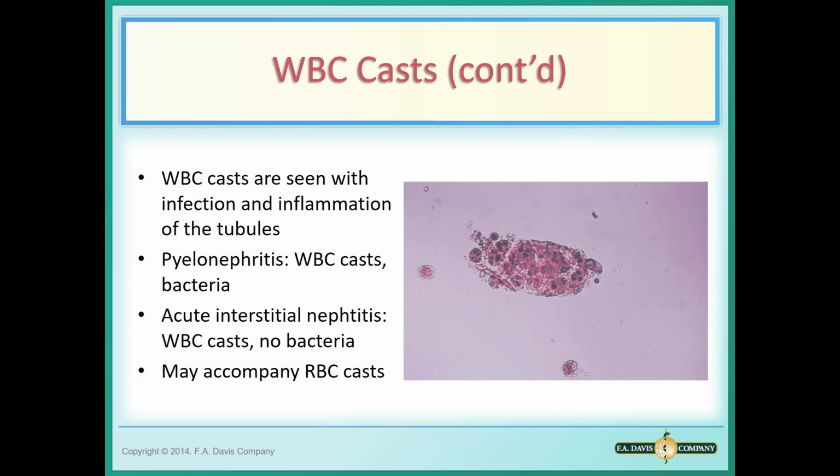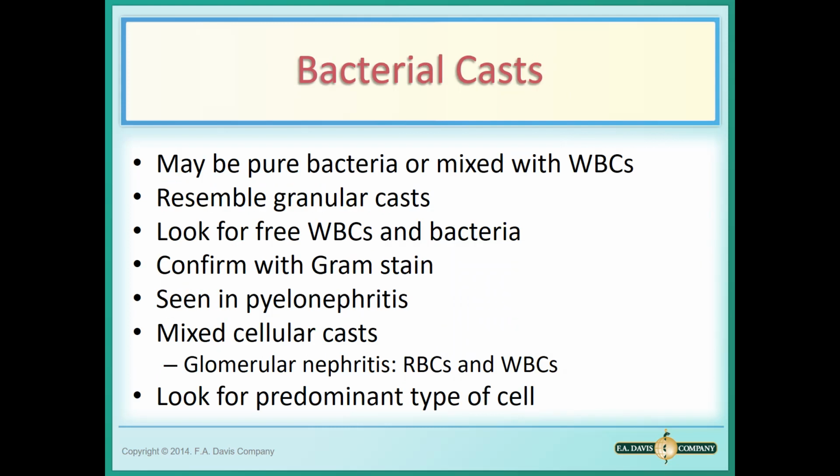I wish I could, I'm flipping ahead. I'm pretty sure you would think, I did just look at this. We are going to talk about granular casts in just a second. I just want you to bear that in mind, that white blood cells degenerate and can look like granular casts.